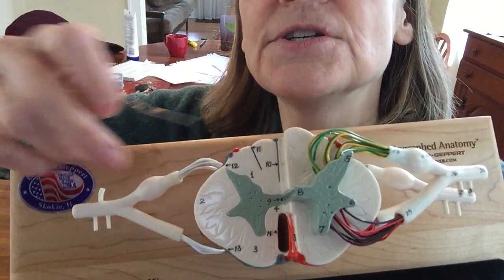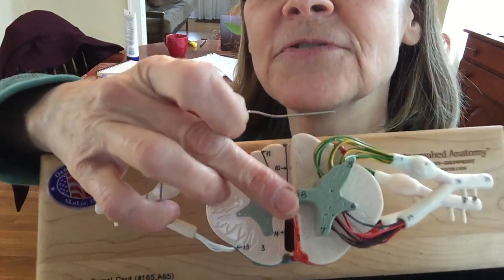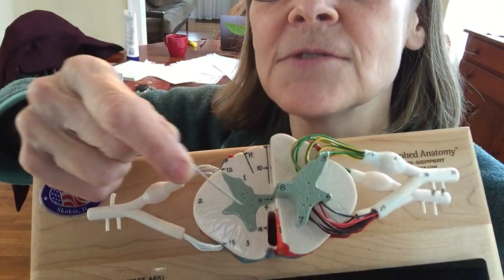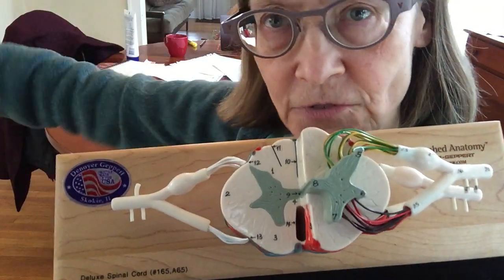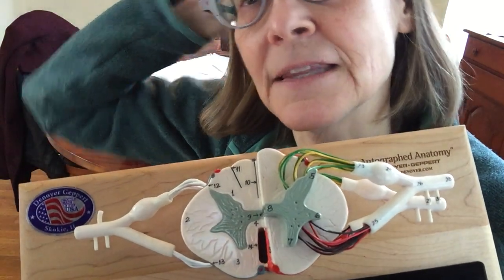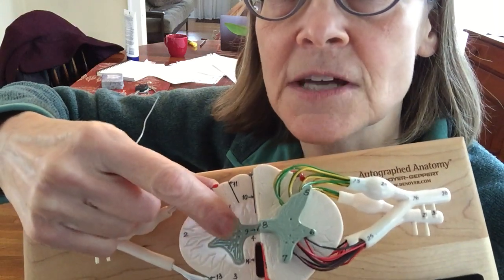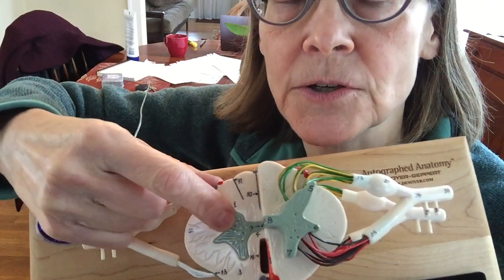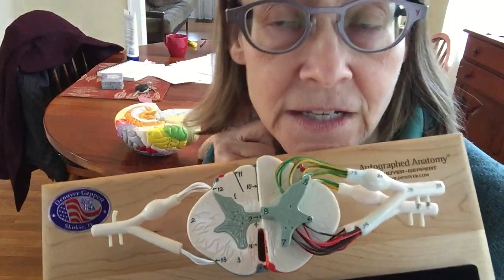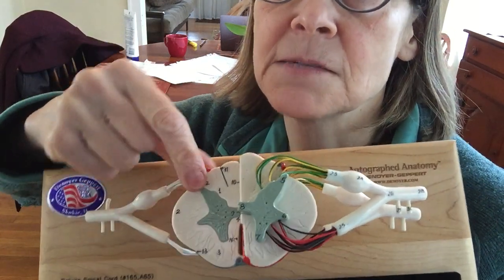Okay, so we're going to be in the spinal cord. This is the butterfly or H shape that you see whenever you look at a cross section of a spinal cord. You're cutting transversely through the spinal cord, and you see the gray matter as a result of that. This is mostly cell bodies of those neurons, lots and lots of cell bodies, and so that becomes darker. This is almost all axons. It's myelinated. We said that myelin is that white fatty substance. That's what's making this matter white.